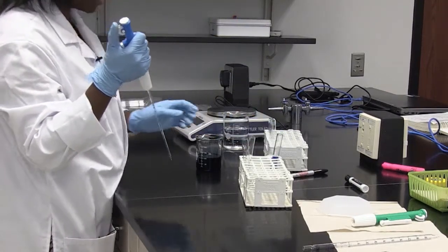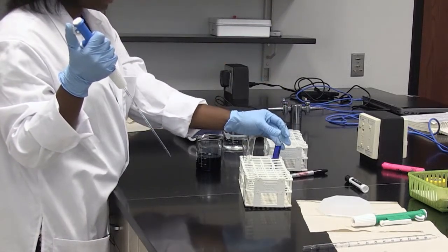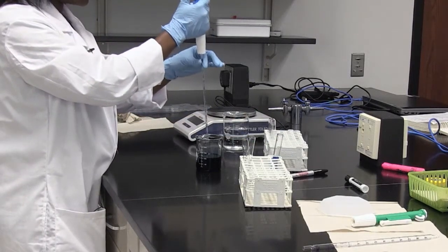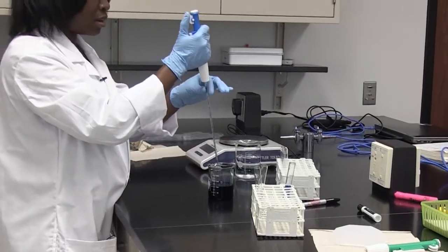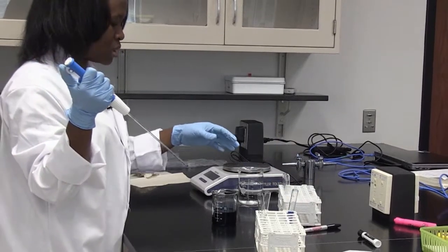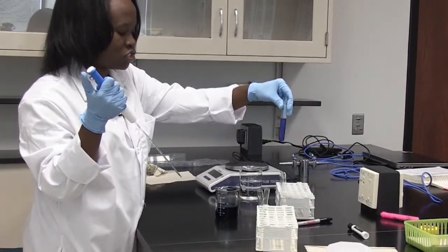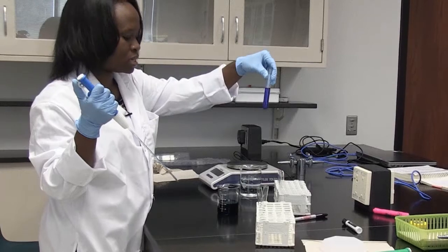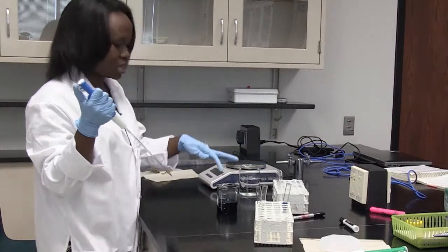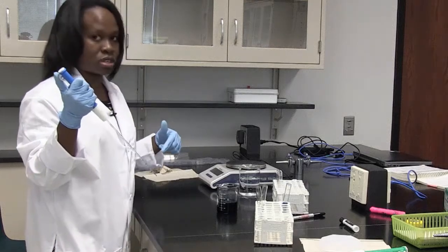I can put that to the back of my test tube rack. Since I made a lower concentration of my blue dye, I can put the same pipette back into my stock solution because it has a lower concentration than my 1 in 10 dilution. You can move your pipette from less concentrated to more concentrated solutions, but not from more concentrated to less concentrated solutions, as that would change the concentration.